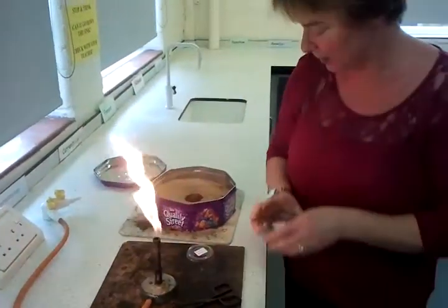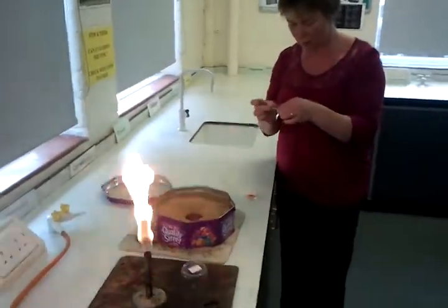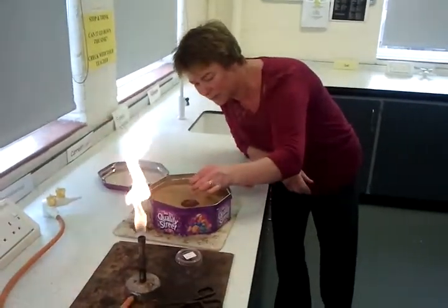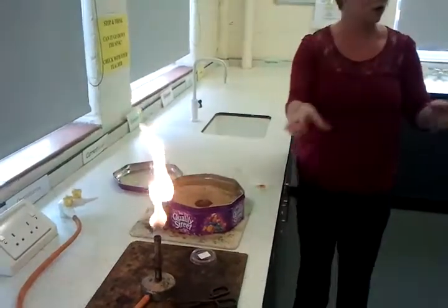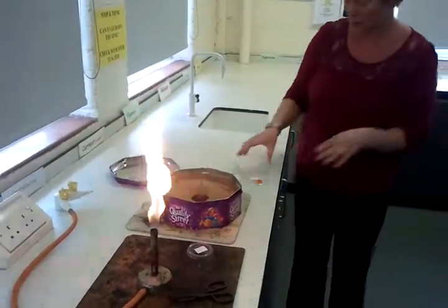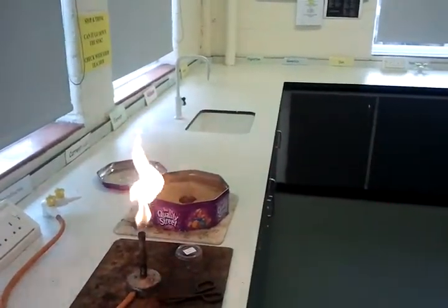Then you just put magnesium. All the grey stuff — because it is a really, really powerful oxidation reaction — it creates a temperature of about 2,000 degrees. The iron oxide, this is what we used to use to weld together training tracks. We'll just put some goggles on.